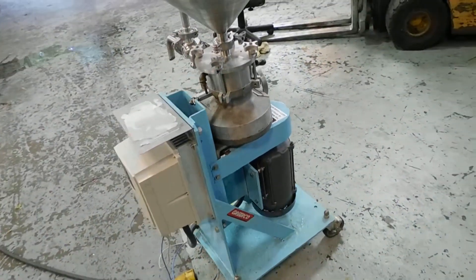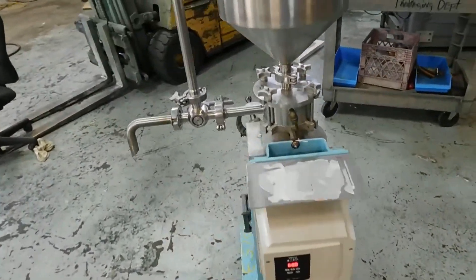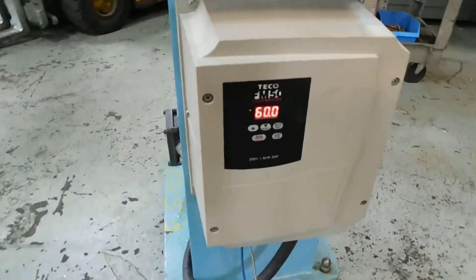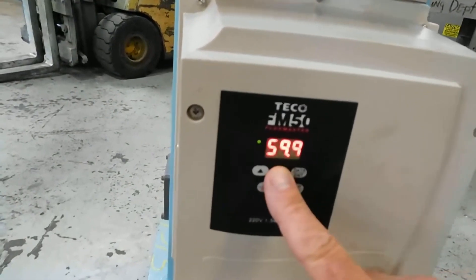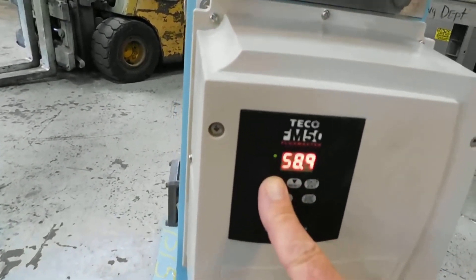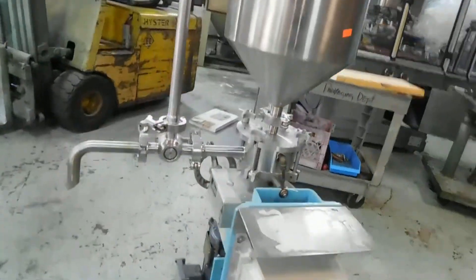This is the 250 series. It's a vertical design; it does come horizontal. We've added a new variable speed controller, as you can see here. It's a TECO push-button controller. You can control your speed here — 60 hertz, of course. What you're seeing is maximum speed right now.